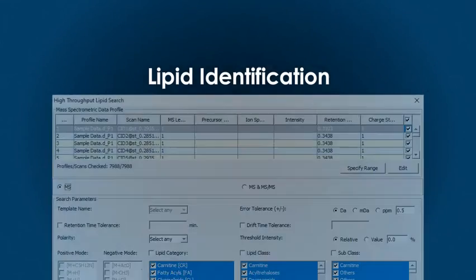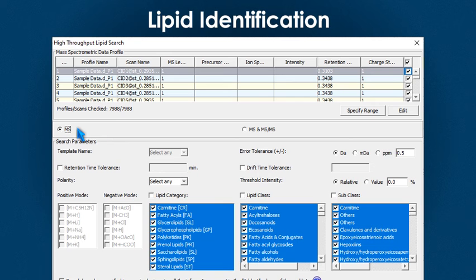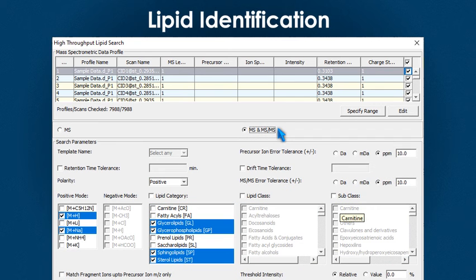About high-throughput lipid identification. Using SimLipid, you can perform lipid search on one or multiple files for MS-only, MS-MS-only, or both.